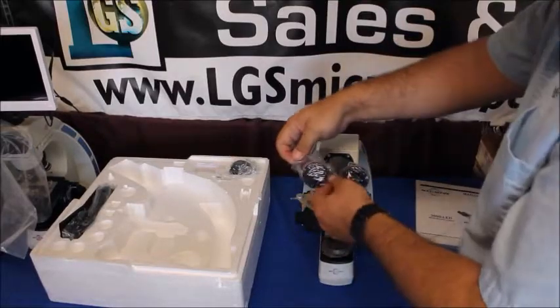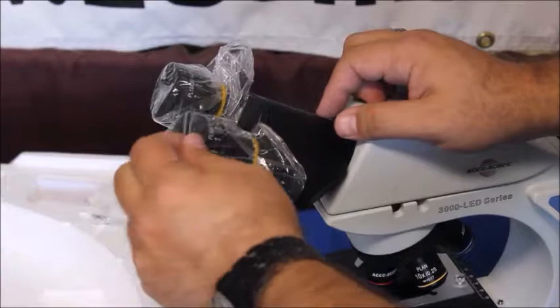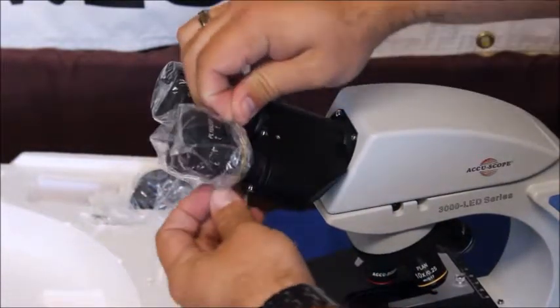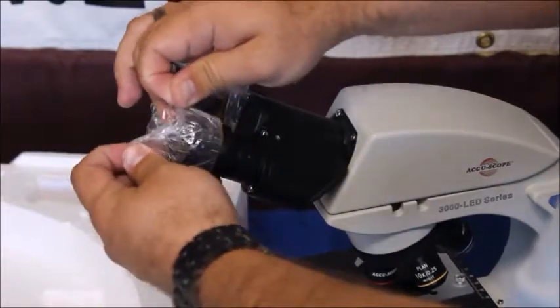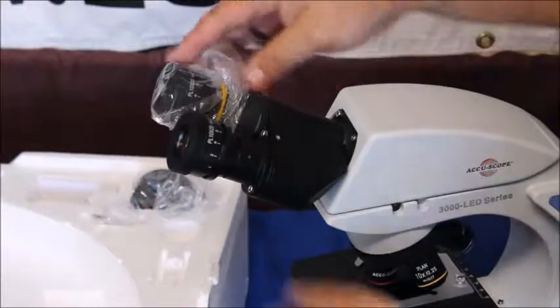Next we're going to pull these covers off. Now these eyepieces, they're going to have these plastic covers and a rubber band. The easiest way to do it is to grab behind this and peel it up. Otherwise your rubber band can get snapped into these little narrow grooves and it's kind of difficult to get it off.